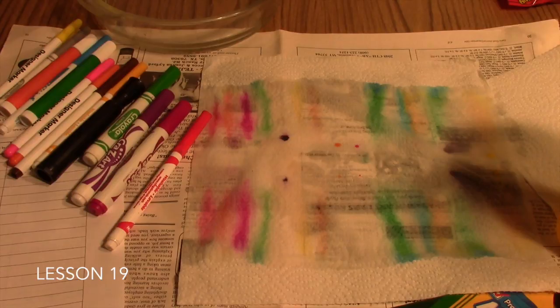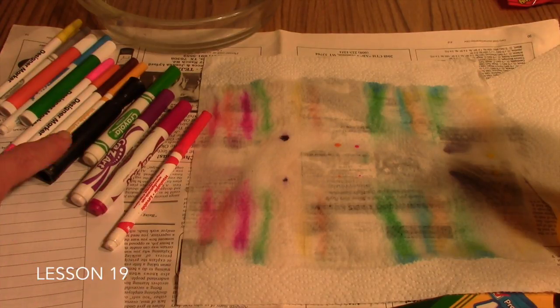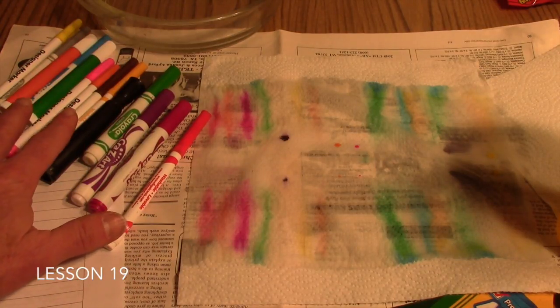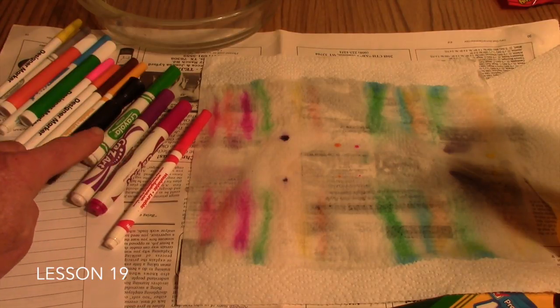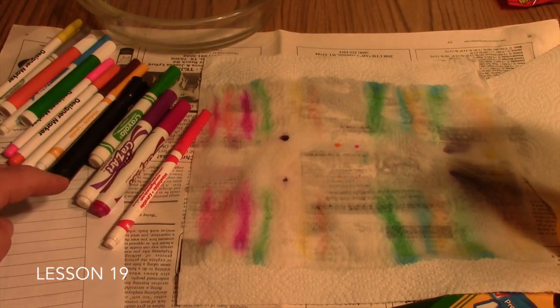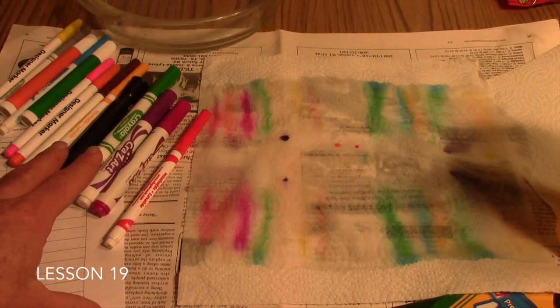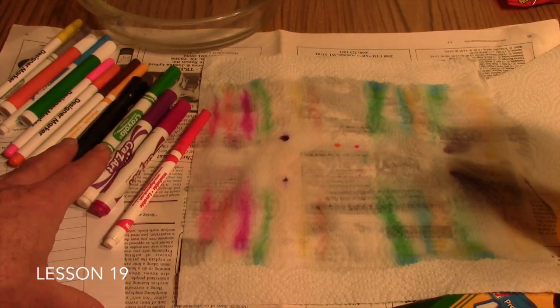Okay, now in your text there's instructions on repeating this using the other two solvents. You would just go through the same process. When you use the markers, it's a good idea to lay them down in the same order that you did on your first trial, and then it makes it easier in comparing the markers as you go from trial to trial with the different solvents.